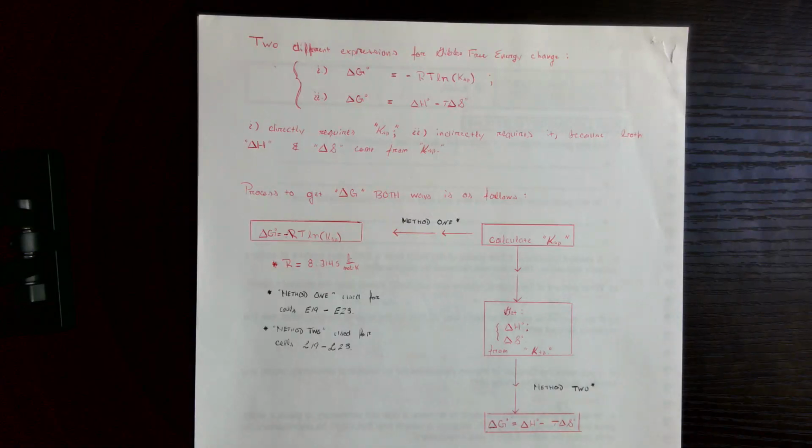This is the pre-recorded lecture video for the Thermodynamics of a Saturated Borax Solution lab. It is the only chemical thermodynamics lab that is included in 122. And it tends to be the one people struggle with the most.